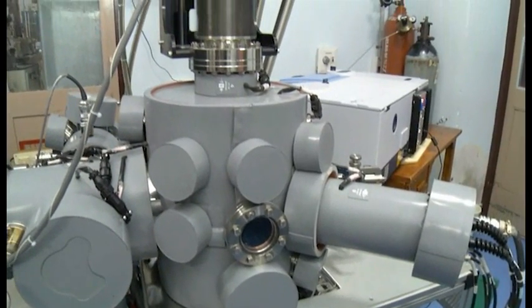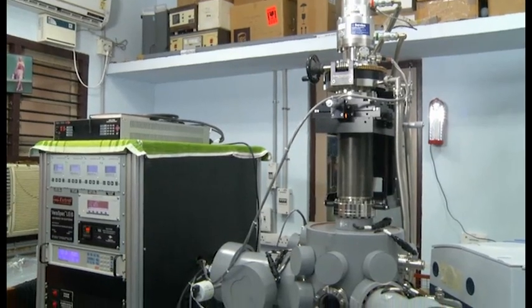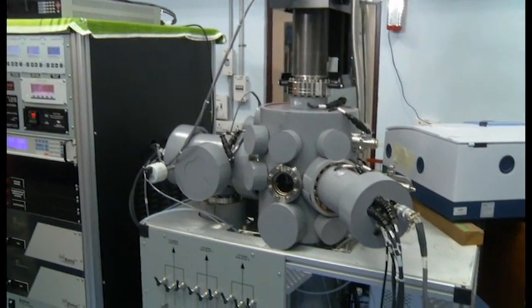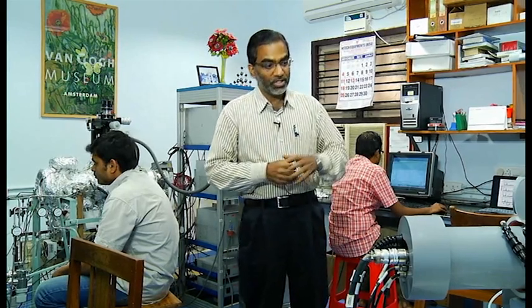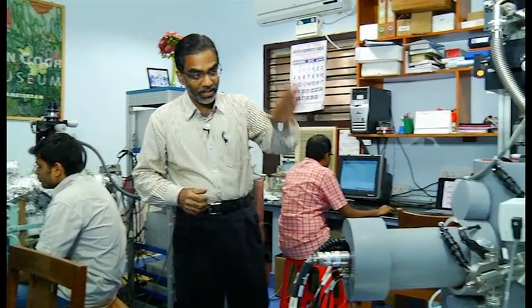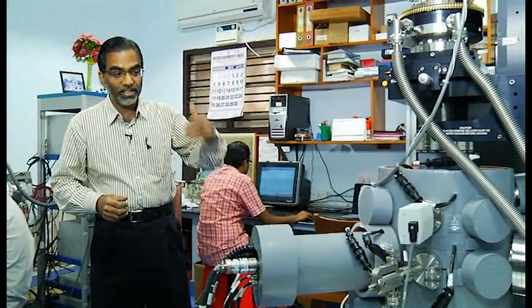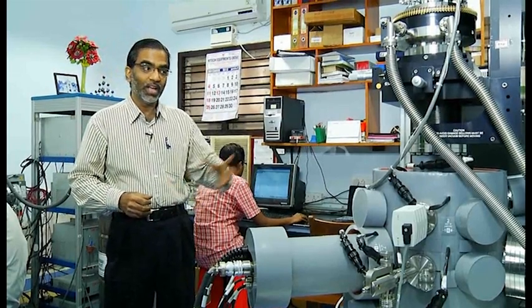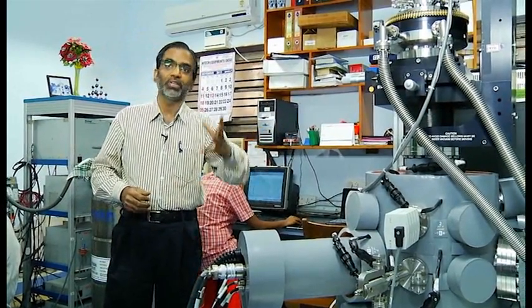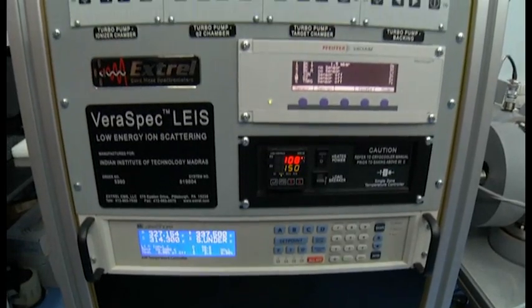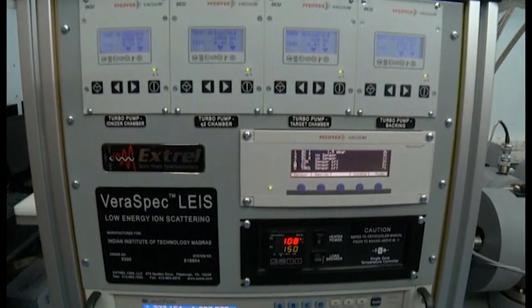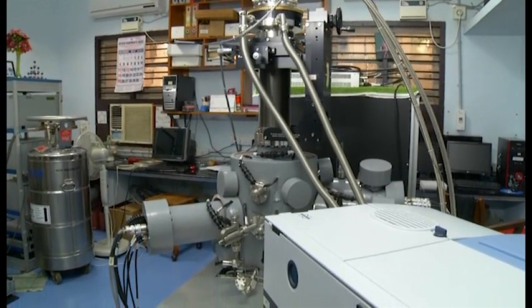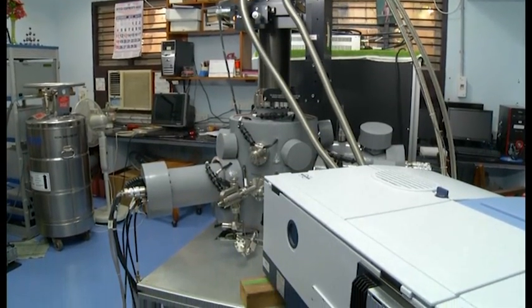What we have made is a very high-quality vacuum chamber, which is called ultra-high vacuum. We take here a single crystal, deposit molecules of ice over that, and then collide ions, mass-selected, energy-selected ions, on these surfaces.